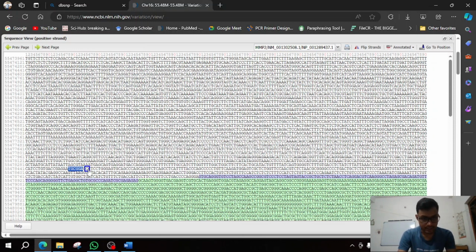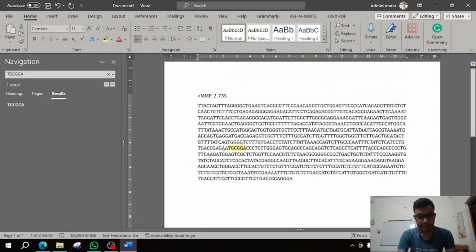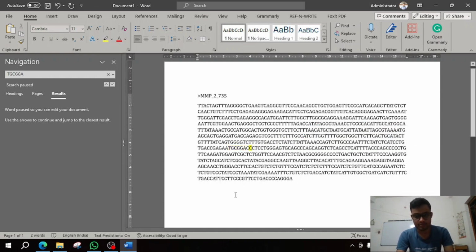Okay, so CCC, TCCT. So here one is selected particularly for your find, and here is CCC and TCCT. So this nucleotide is your particular polymorphism. Okay, so mark it just here, and now we jump into the primer design.